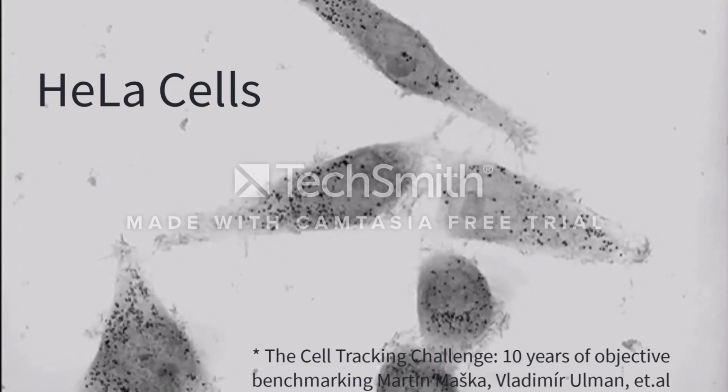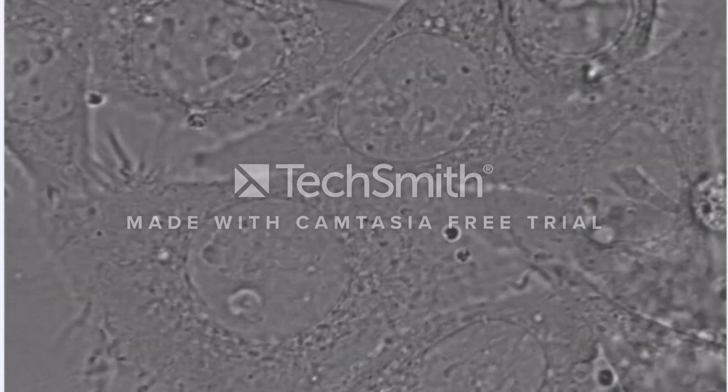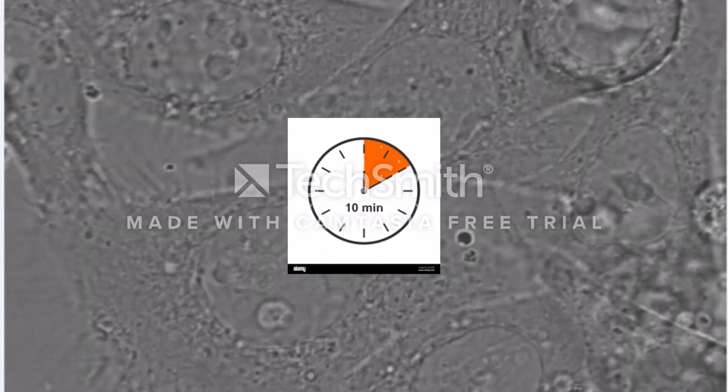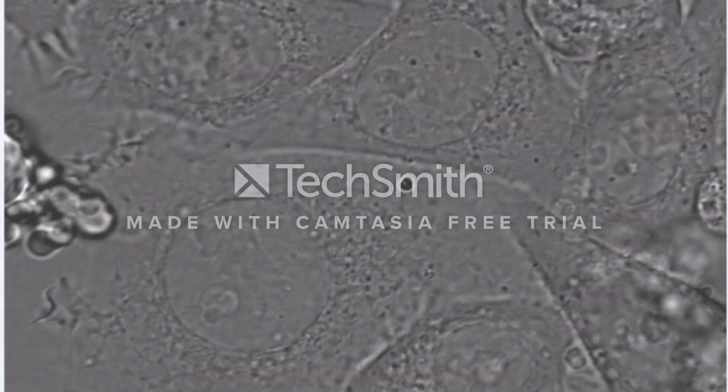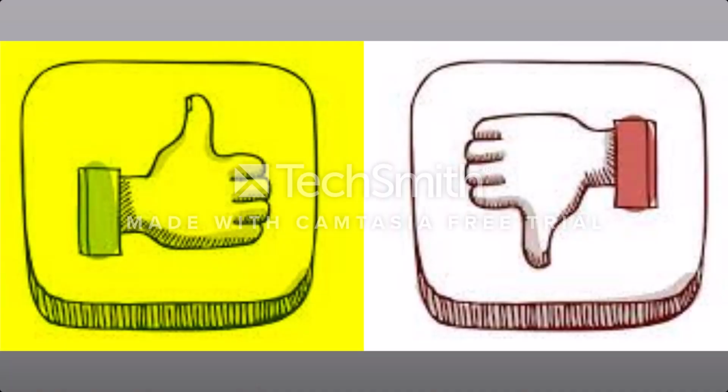These images are from the HeLa dataset, where you can see evolution of cells captured within a specific time acquisition of 10 minutes. The data was captured at Department of Cell Biology in Rotterdam, Netherlands. One of the advantages of this data is that it is widely distributed and used for research purposes. They have been very crucial in various scientific advancements. Also, this is a very versatile dataset as it is used for diverse scientific studies, from virology to cancer research.